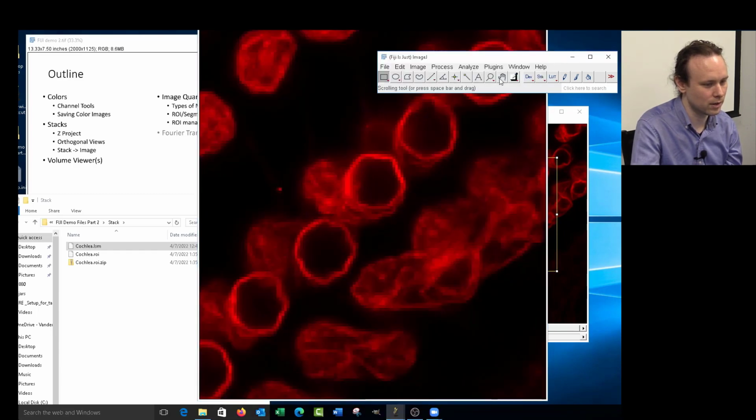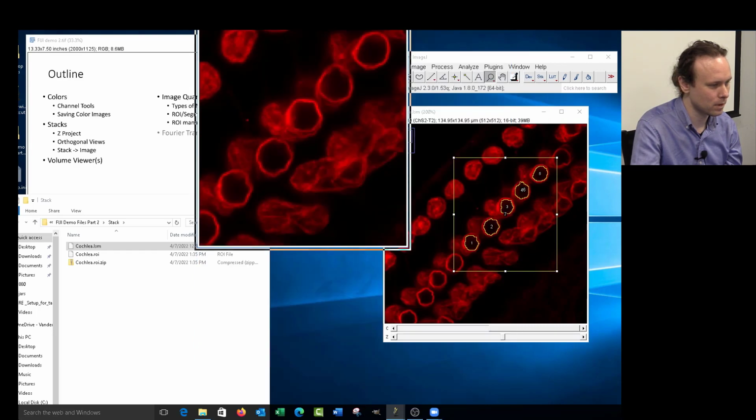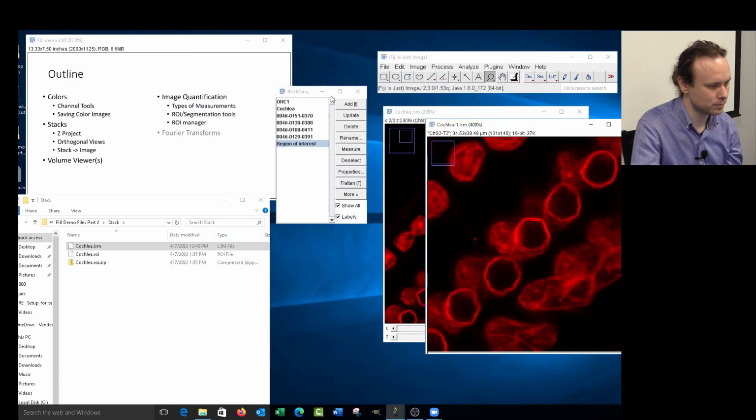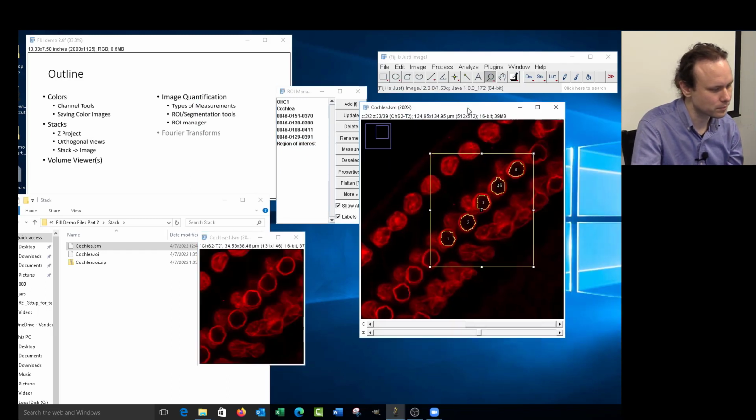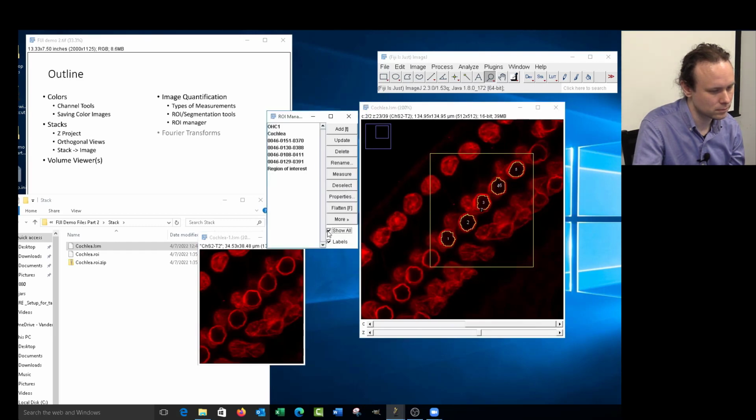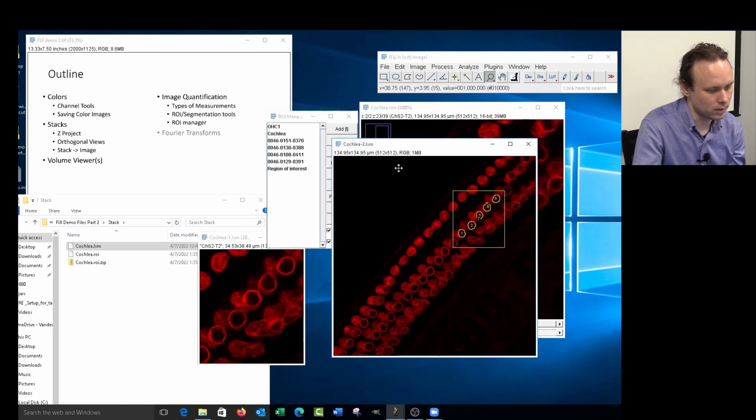Let's shrink that down. And so this would, well, we can just do it. This will flatten this so you can save it, just to show what you've done. This isn't for publication, it's more for just showing what you've done somewhere.